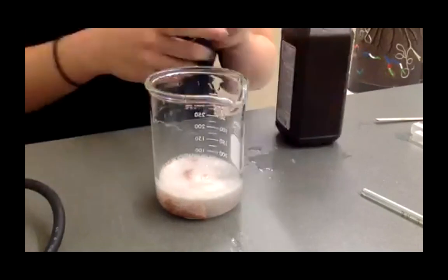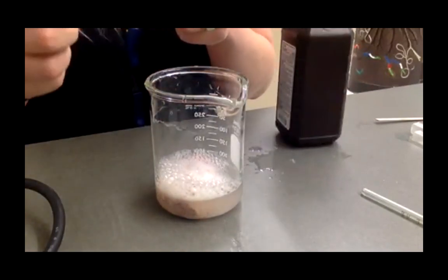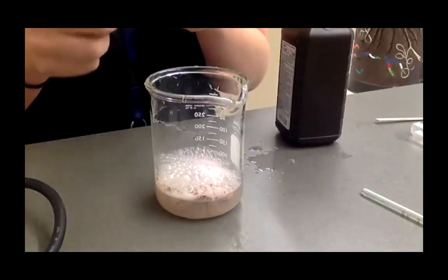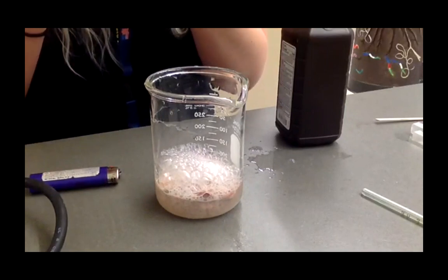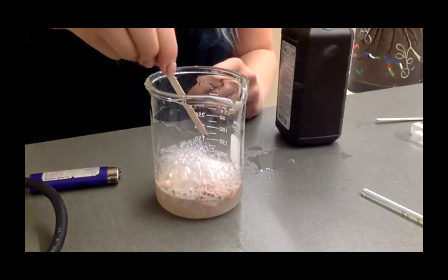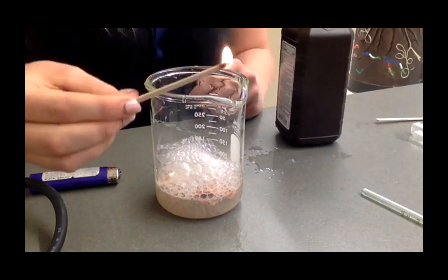Okay, liver is going. We see bubbles. Okay. We have an ember going. Look at that. Caught on fire.